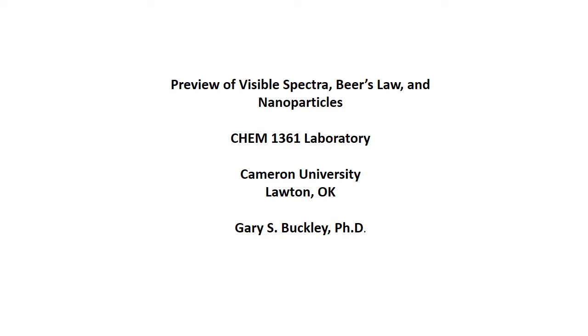I don't know how quick it is, but I'll give you a rundown on the upcoming experiment on visible spectra, what's called Beer's Law, which I never really use that term, and nanoparticles in this particular laboratory. You'll see a little bit about the background of the experiment. You'll also see some of the technology, how we're going to use some of the technology which you haven't seen before yet.